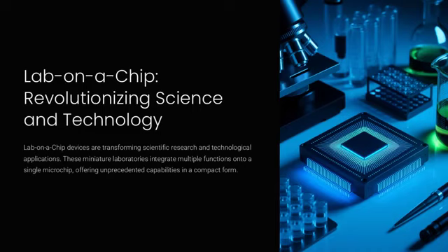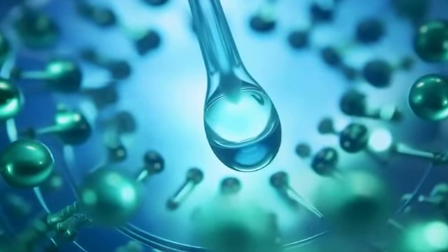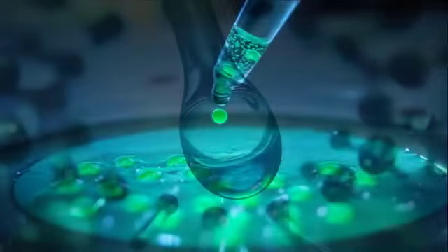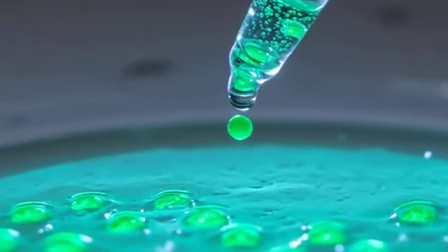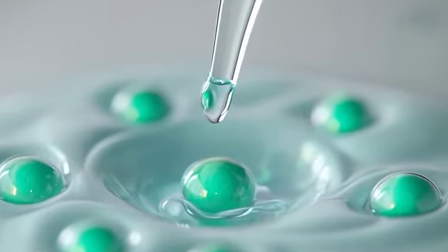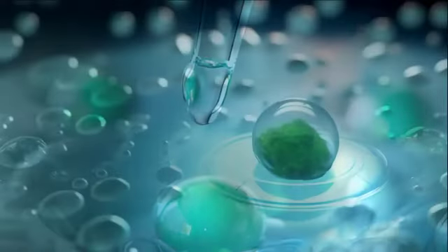Lab-on-a-Chip devices integrate multiple laboratory functions onto a single microchip by combining microfluidics, microelectronics, and micro-optics. For example, a chip in a pharmaceutical lab can synthesize, separate, and analyze chemical compounds in one compact platform, much like a Swiss Army knife that houses many tools in one convenient multifunctional unit.